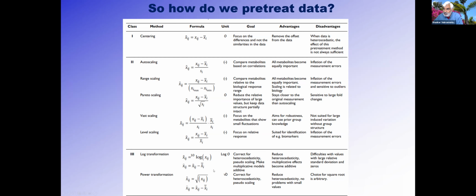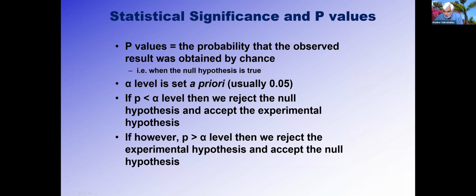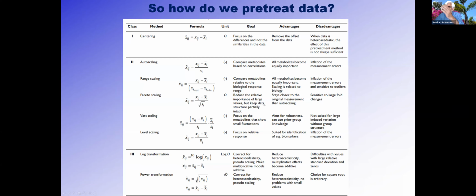I'm not going to go into details. We don't do it usually in lipidomics experiments. So I'm going to give you a log transformation. Now, how do you know? We do all of these. At the end of that, we get a list of data samples. We say these are all the data that we get for lipids.